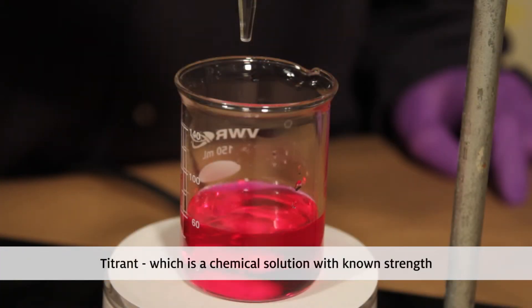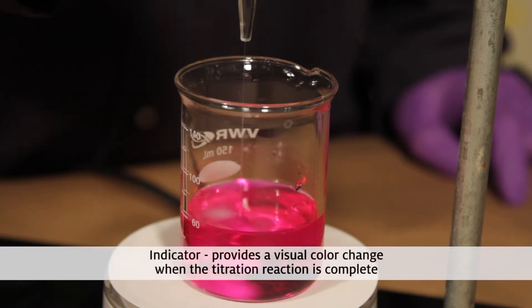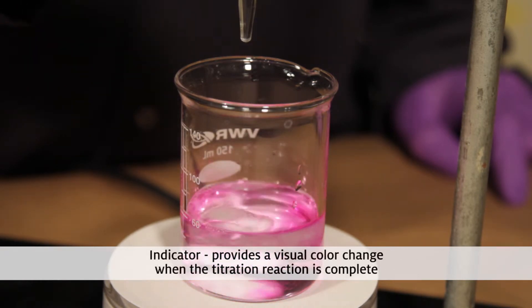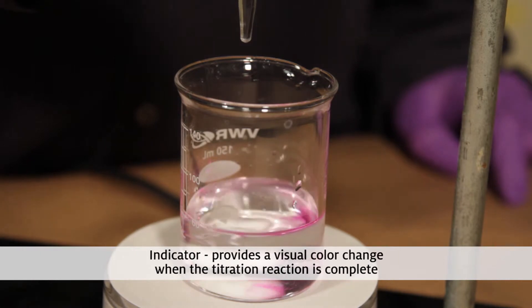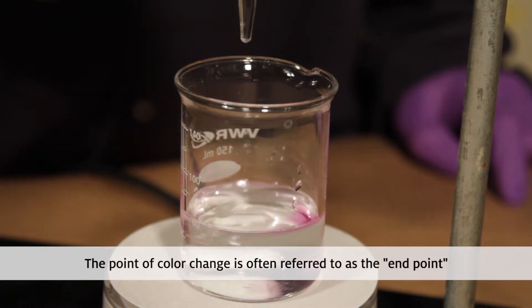Titration test solutions usually include a titrant, which is a chemical solution with known strength, and an indicator, which provides a visual color change when the titration reaction is complete. The point of color change is often referred to as the end point.